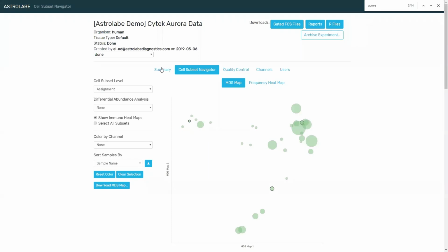So, great question: compensation and unmixing. We can think about compensation as a simpler way of unmixing. When we do compensation in a conventional cytometer, we have a square matrix, meaning that you have n number of fluorochromes going into n number of detectors. So that's an n by n matrix.